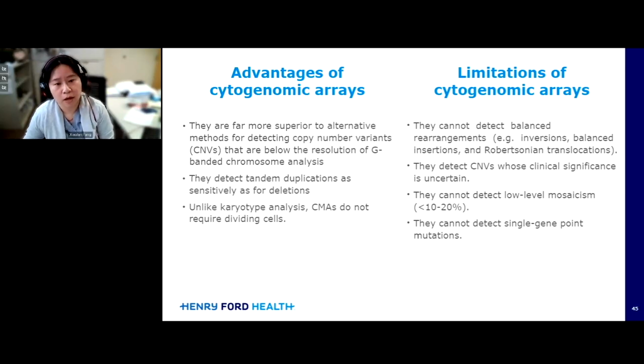Because FFPE samples were originally developed for pathology use, they are meant to be stained with either IHC or H&E. For DNA extraction, they are not the optimal samples that we would prefer to use.